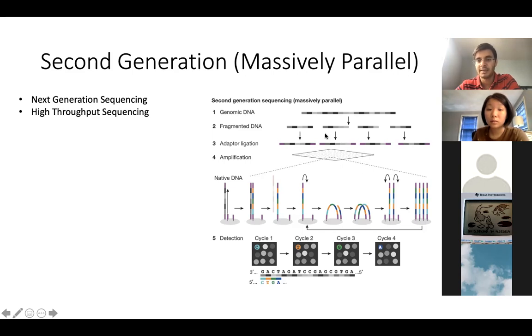So for instance, the Illumina MiSeq generates an average number of reads around 25 million reads. So what 25 million reads means is that there are approximately, I am talking about approximate numbers, there are approximately 25 million spots here, 25 million spots, each with something like this.